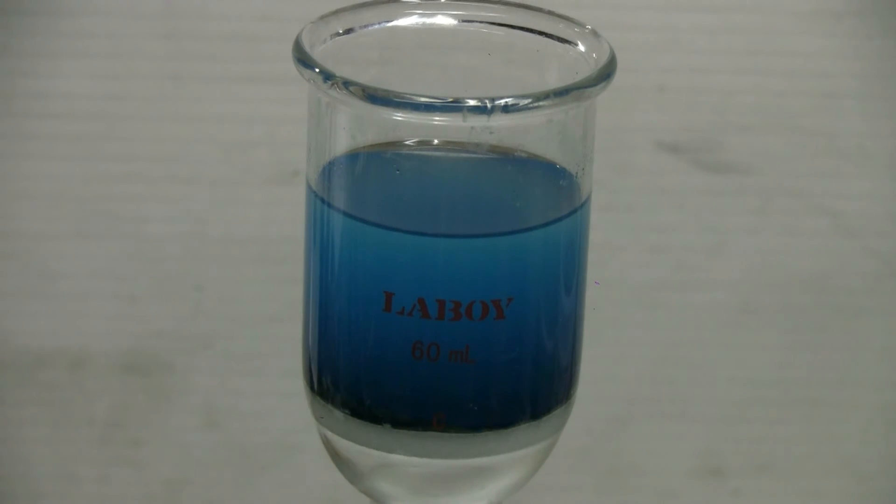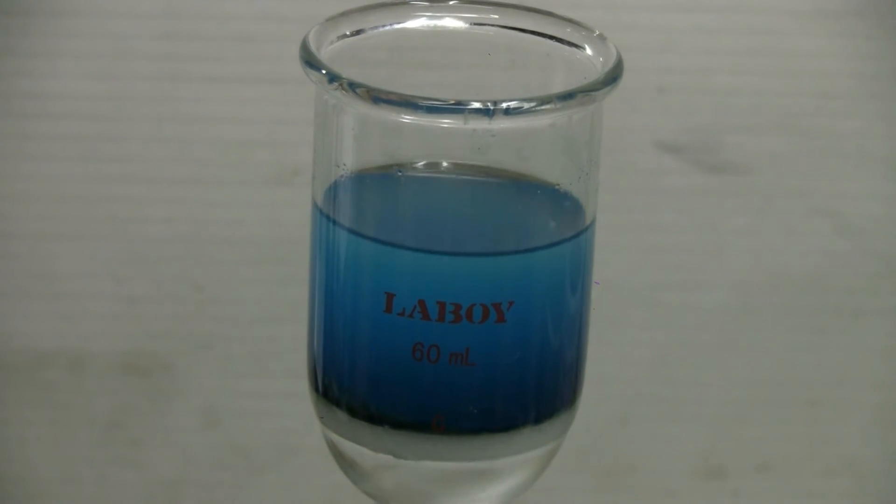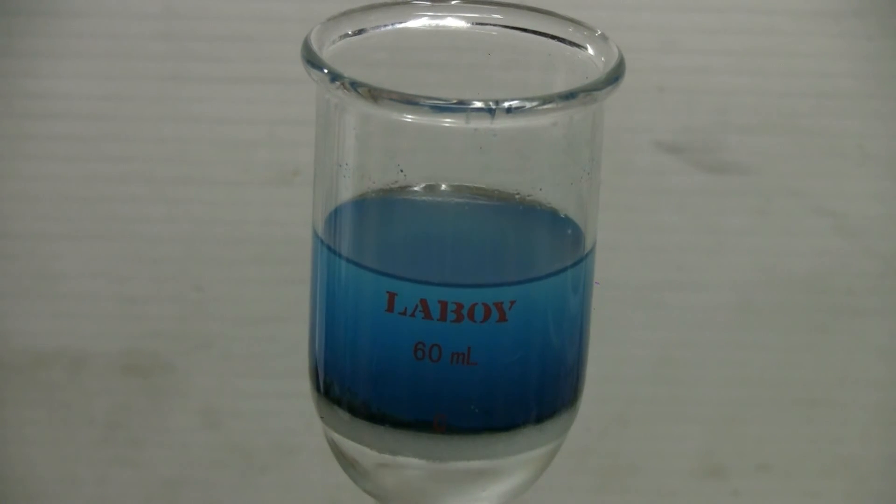Let's hook the vacuum line back up and pull off the isopropyl.